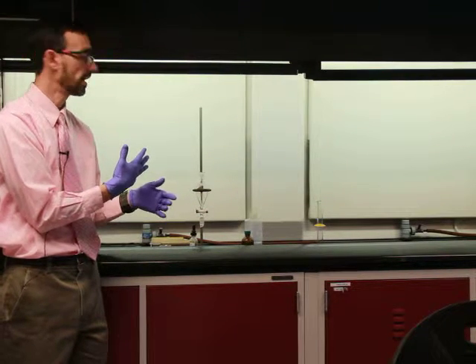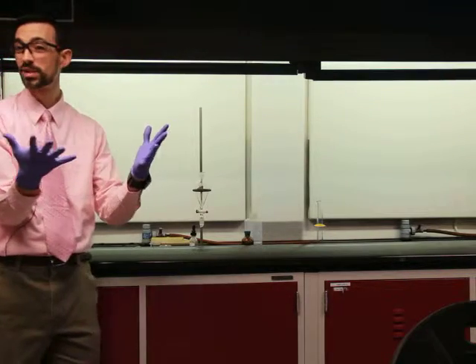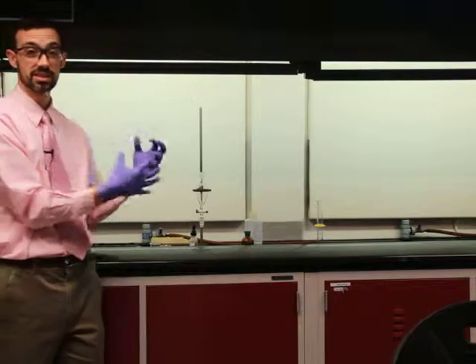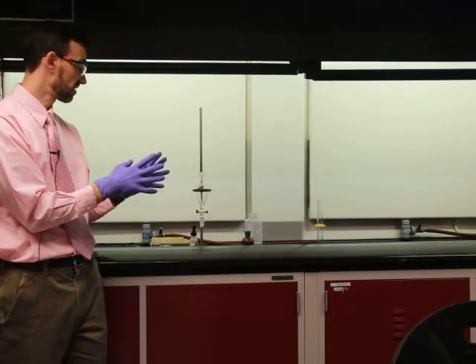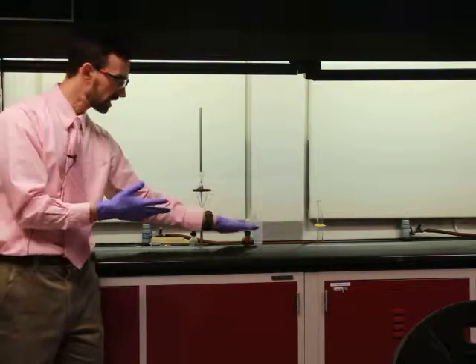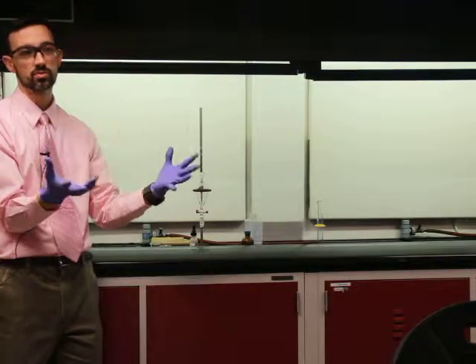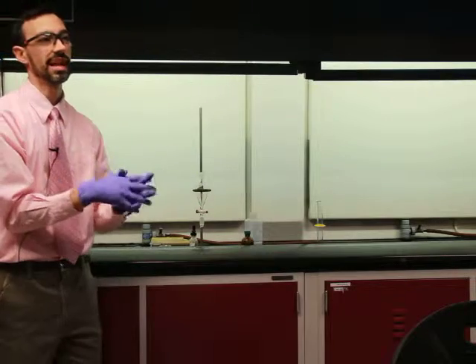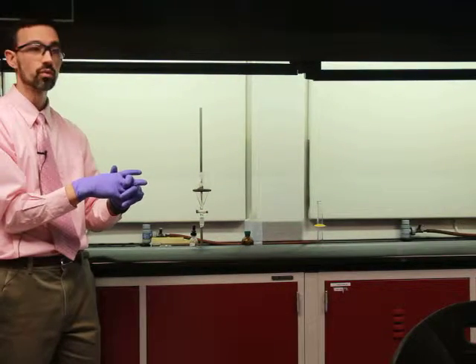No? All right. So I'm sorry that we didn't get to do it. Notice that I did wear gloves. That's pretty common when you're doing this, because the stuff is kind of nasty that you don't want to get onto your hands. Particularly, the ether by itself is not dangerous, but it dries your skin out like crazy. And we're at a time of the year when people's skin is naturally already dry and cracked, and this would just make life even worse.